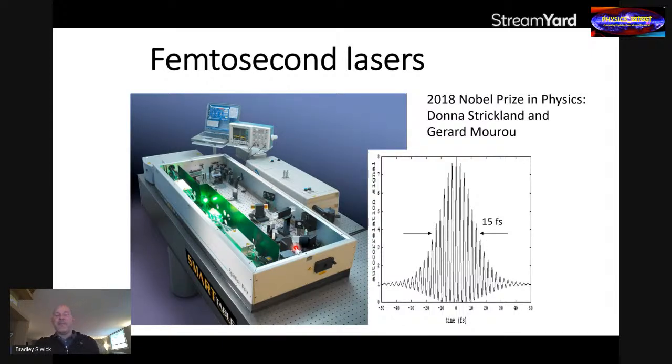going to have time to speak about that bit of technology specifically, other than to say it's allowed for the development of very capable, both powerful and stable lasers that work rather differently than the ones you might be familiar with in your everyday life. That is a laser pointer, okay? So laser pointers generally produce a continuous stream of light output when you push the button.